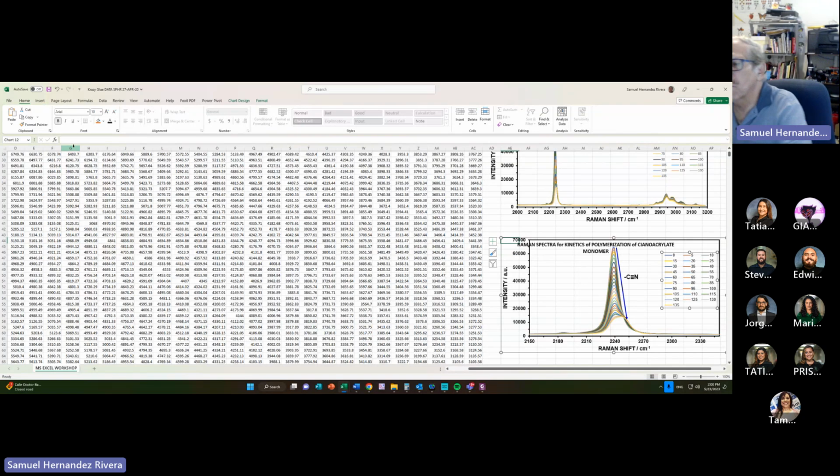This is a good question for a doctoral exam. So beware, if you can't handle this question, this is just simple chemistry. What is the meaning when a Raman band shifts towards the right?